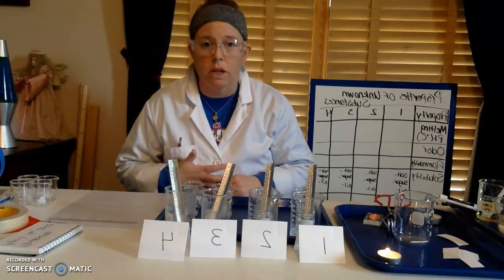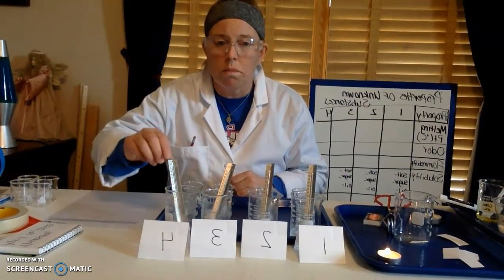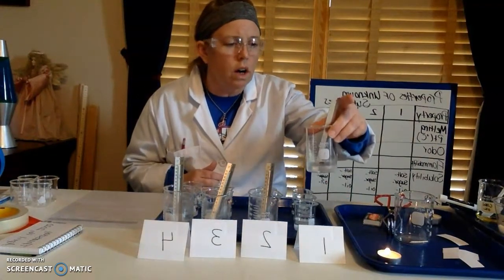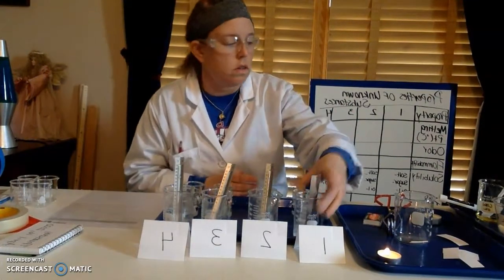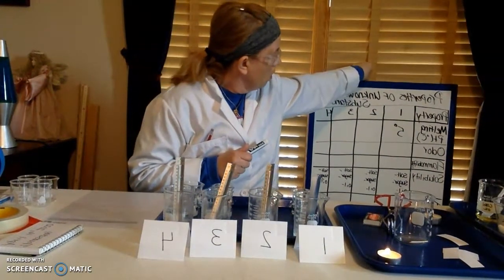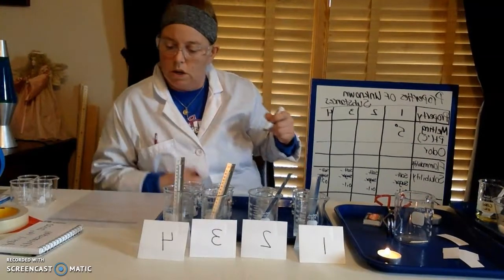So obviously that is the point where I put these 4 unidentified substances into my deep freeze. And hopefully you can see at home, I have placed our thermometers into each of these beakers. So the current reading on substance number 1 is 5 degrees Celsius. So I'm going to write these. And I have your unit there. The temperature for liquid number 2 is also 5 degrees.